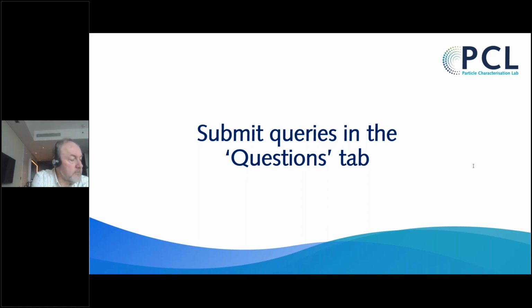All right, there's another question that came in. It says, in your experience, what other techniques complement well with DVS? Karl Fischer titration is sometimes useful complementary information to have. DSC can be helpful as well.